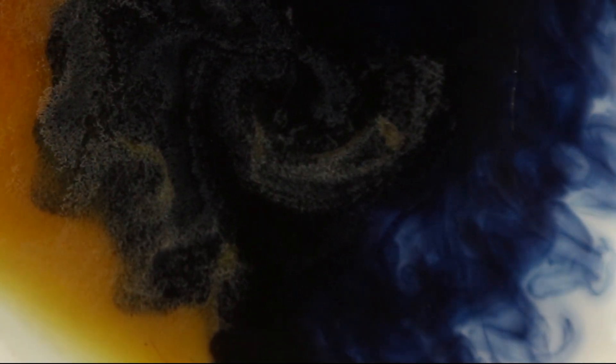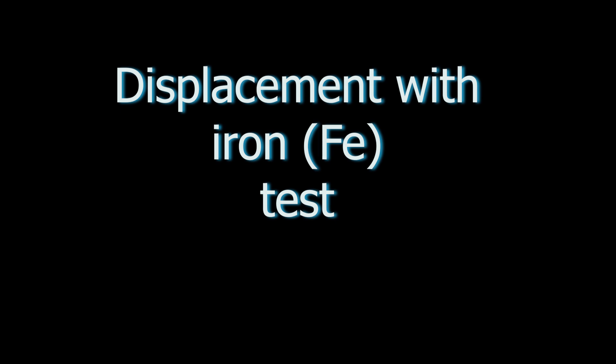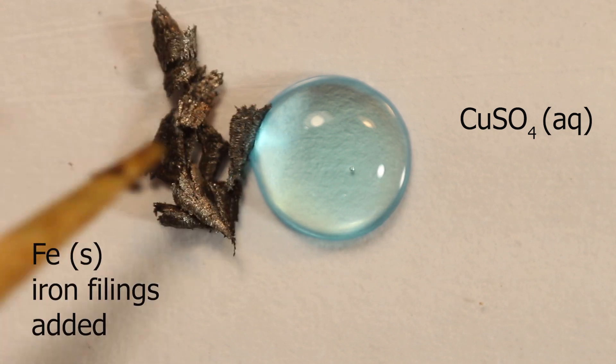Now the most direct test for the presence of copper II ions is just to get copper metal out of them. And for that we use iron filings here.